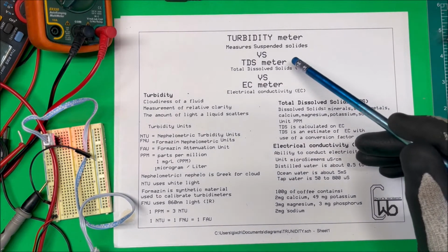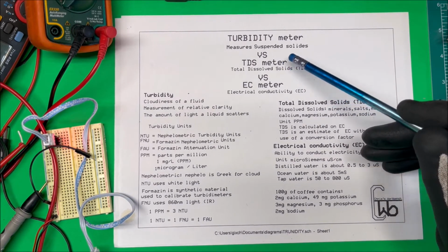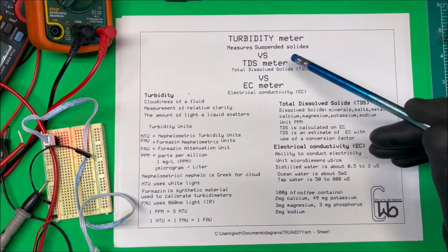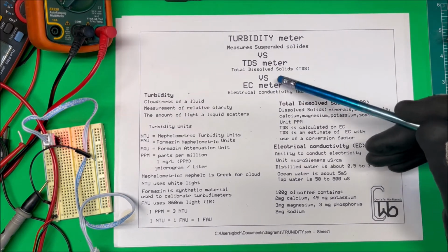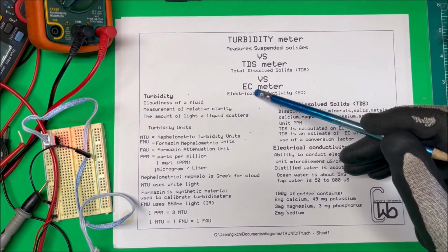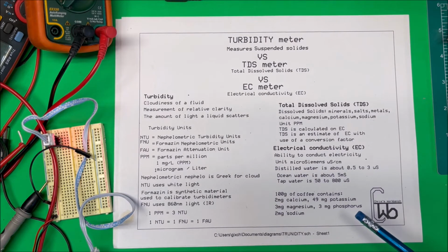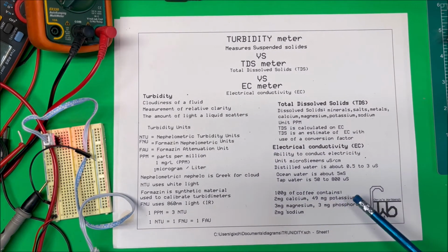So a lot of times you'll see people using these for turbidity meters, but they don't measure turbidity. They don't measure the suspended solids, just the dissolved solids. So two different meters, and the TDS meter just uses an EC meter, and then they calculate the TDS in parts per million. But that's about it on turbidity and TDS and EC meters.